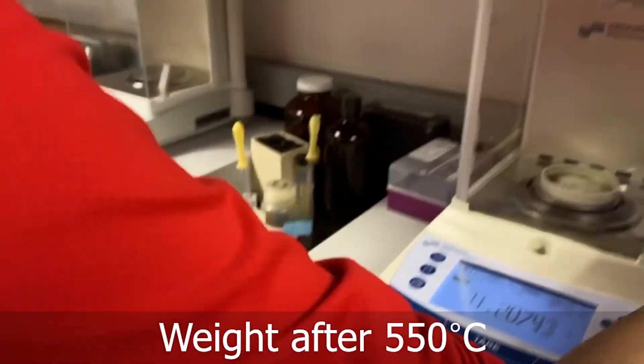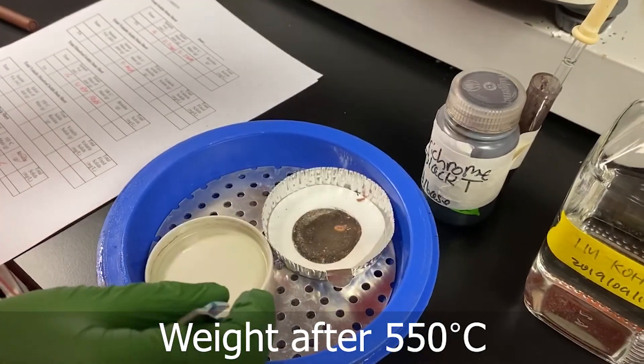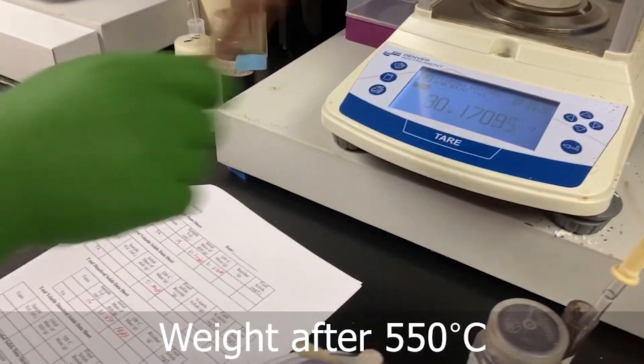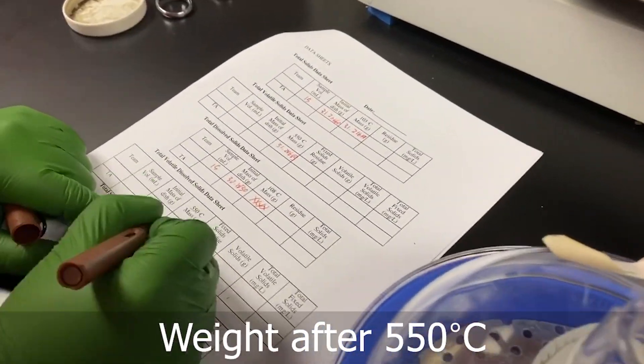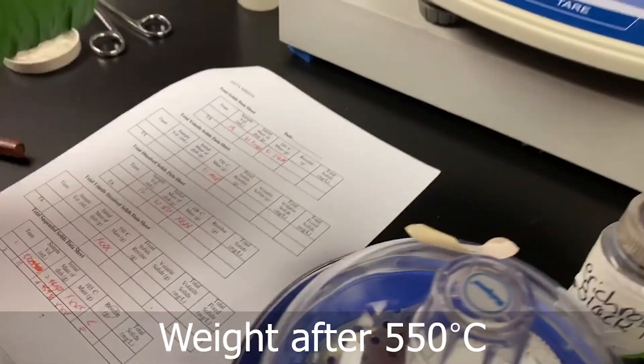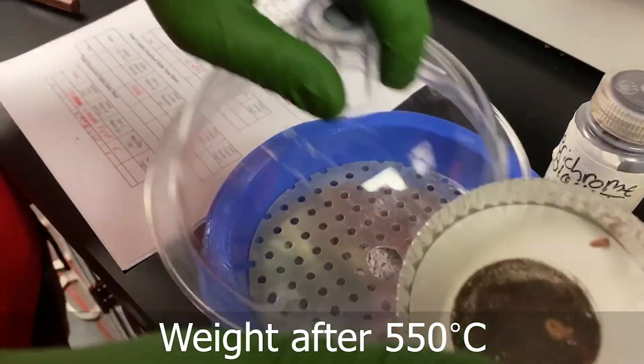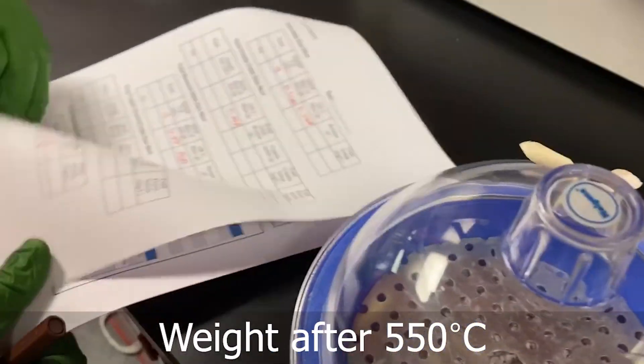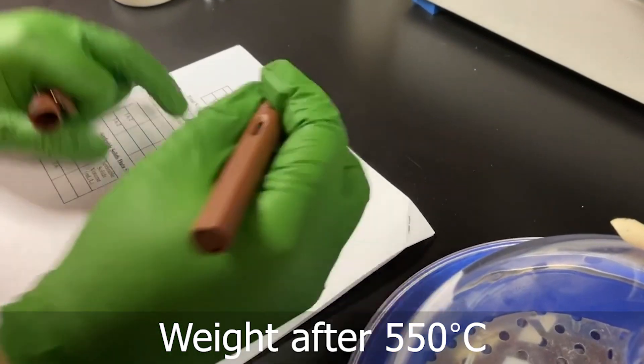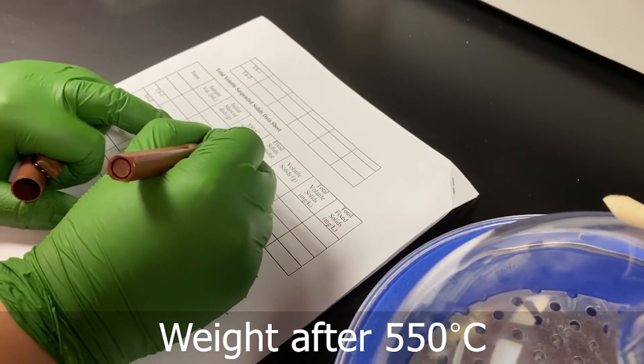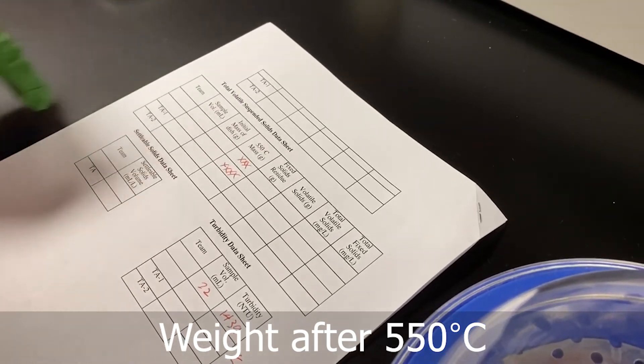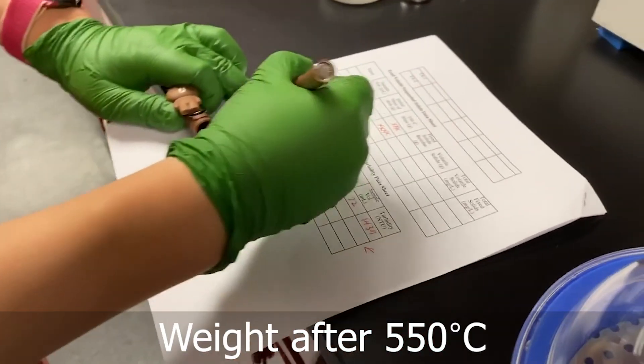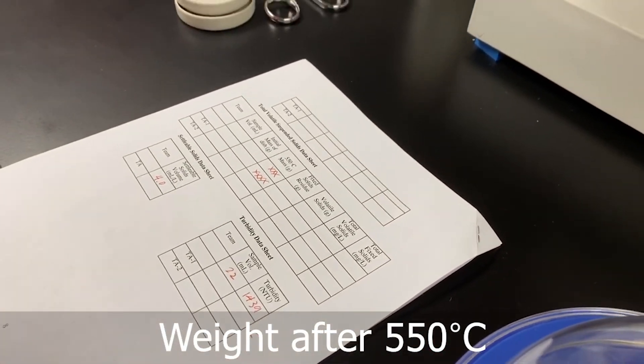So we have another mass and then we are going to measure the volatile solids. So we have almost done everything, and then we are going to write down the settleable solids reading. It's four ml. And that's it.